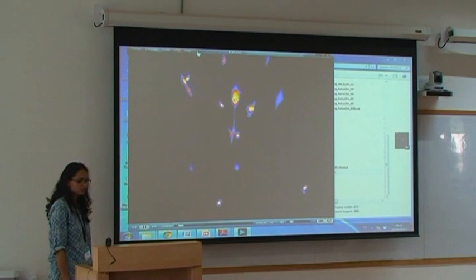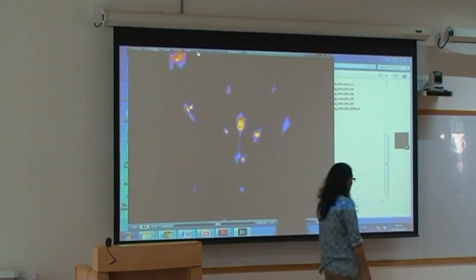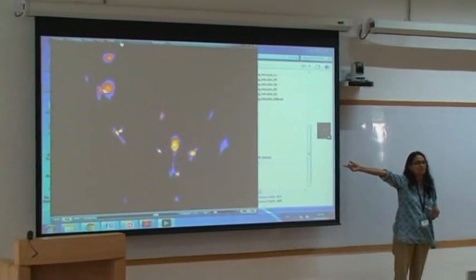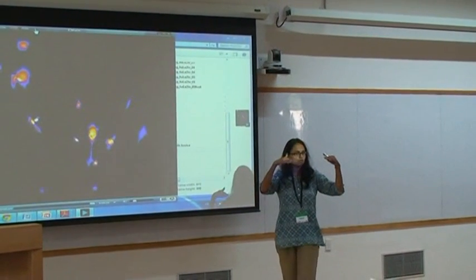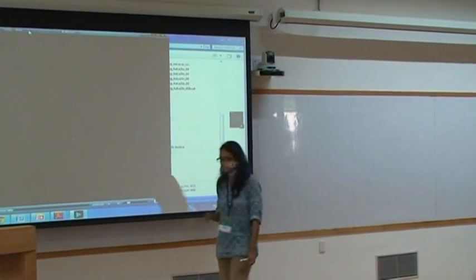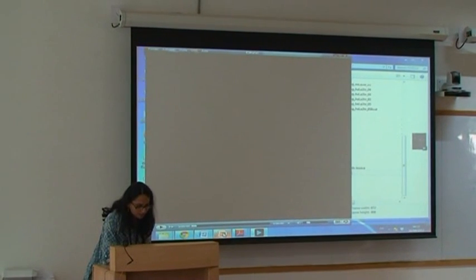So the center is moving, the whole thing is basically moving. But the good point is, and you have to see the good in everything, that even though you're looking at 10x and you're moving a lot, this thing is more or less staying in focus, which is not bad at all. For something floppy, done on a machine, not with very much precision, when you stress it like this, not moving too much in Z is good.